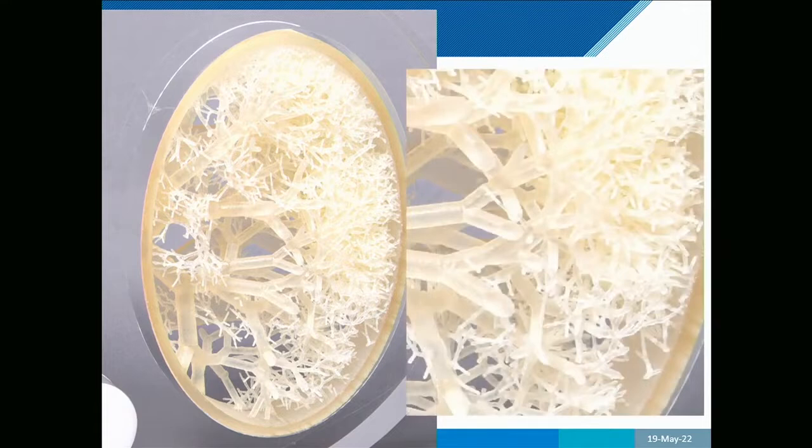So one of the questions we have is, okay, I had the model, I know what it looked like, I have the 3D printed version of it, but how can I actually do a quality control of the 3D printed object that I have? How can I make sure that the vessels that I've defined in my model, in terms of their location and also their sizes, their diameter, are what the printer has provided me?